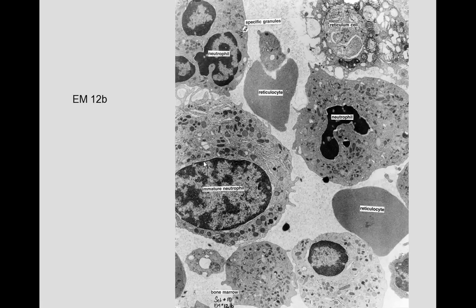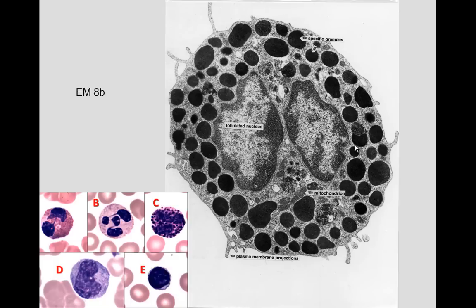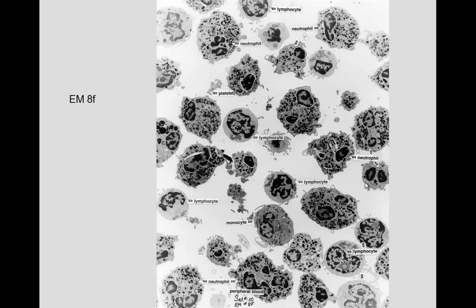Another electron micrograph shows a neutrophil developing near a nurse cell. We can see the dumbbell-shaped specific granules. An immature neutrophil starts with an oval nucleus that becomes lobulated as it matures. In contrast, the basophil has large blue granules without a crystalline core.